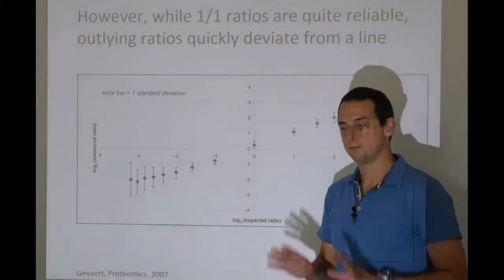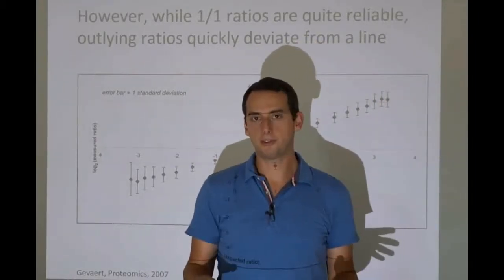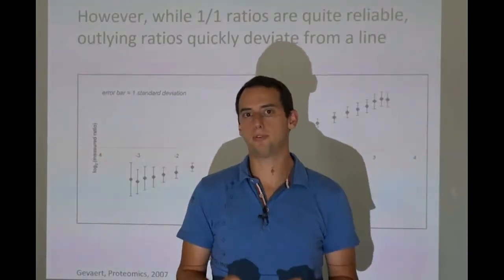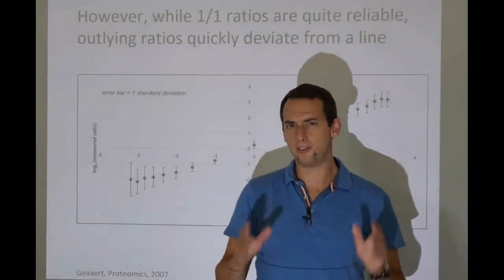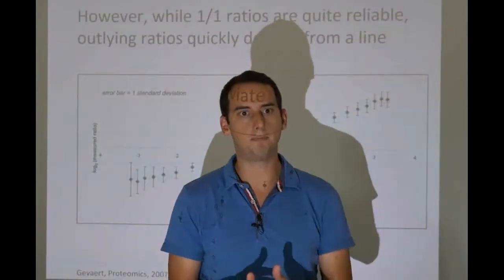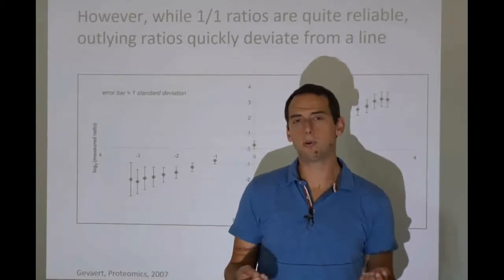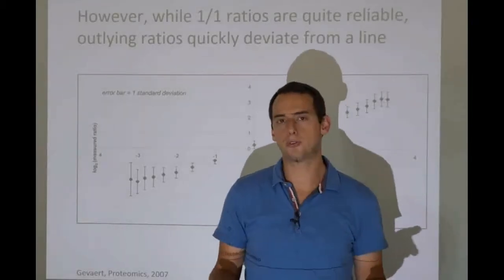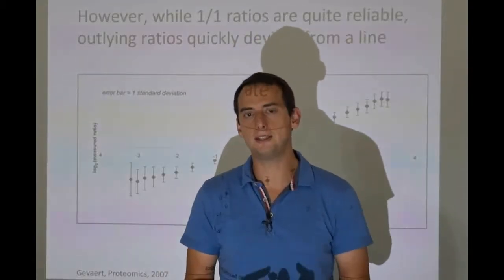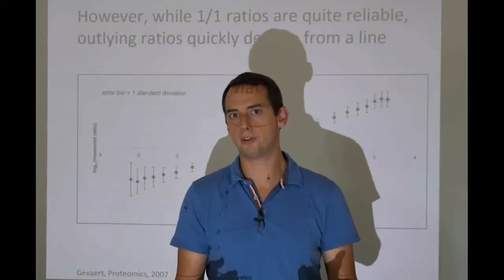Any detector, including our eyes, our ears, and our skin, and anything else we've ever built, or nature has ever built, follows a certain type of response curve. Think of it this way. If you're in a very, very dark room where there's not a single photon of light, it will look dark and completely black to your eyes. Obviously, there are no photons, so your eyes cannot see anything. Now, if I were to bounce, say, 5 photons around in that room, it would probably still look dark, because 5 photons simply isn't enough for your eyes to perceive anything. You may need 100 photons before you start seeing something.